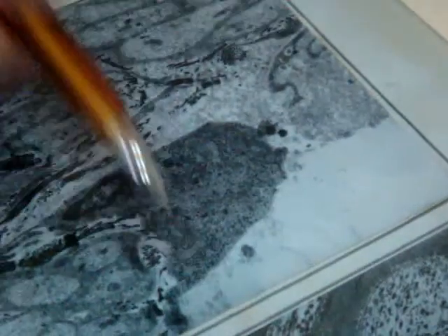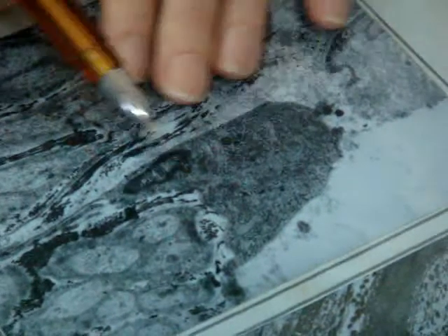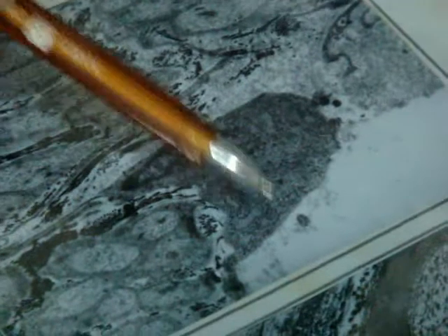Without basement membrane, so this is connective tissue, with one part of a very small nucleus. We can see rough endoplasmic reticulum here, this is a fibroblast. This is part of one cell, and we can see the Nissl body, mitochondria, and a lot of microtubules.